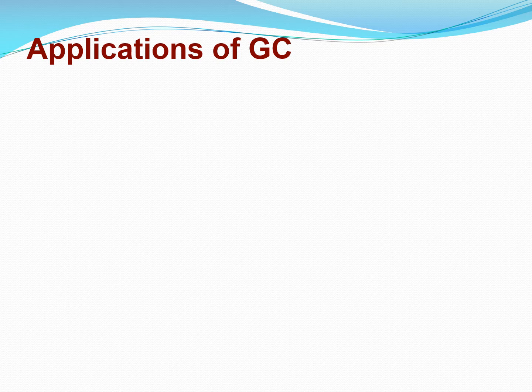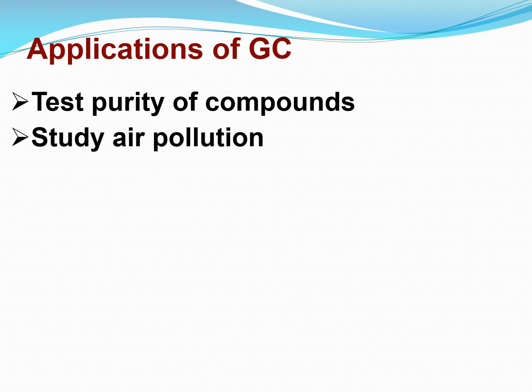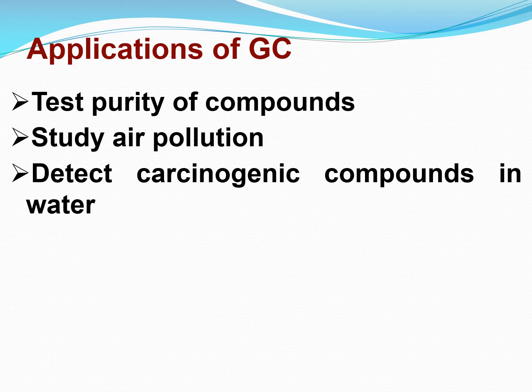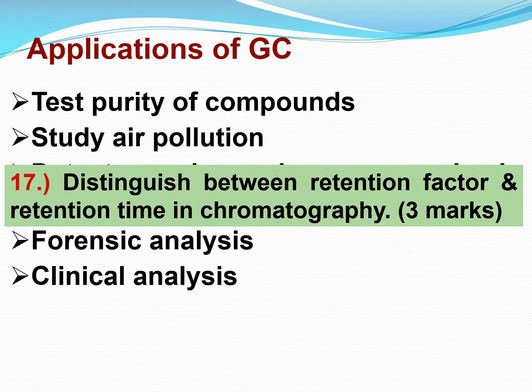What are the applications of GC? Testing purity of compounds. Studying air pollution, a very important application. Detecting carcinogenic compounds in water. Forensic analysis, clinical analysis, etc.